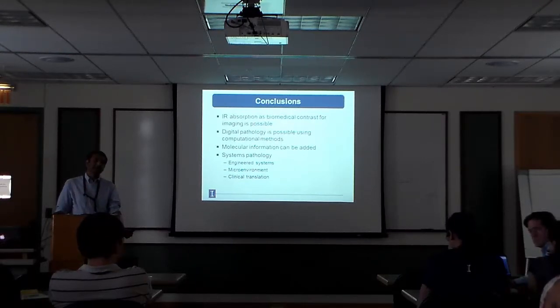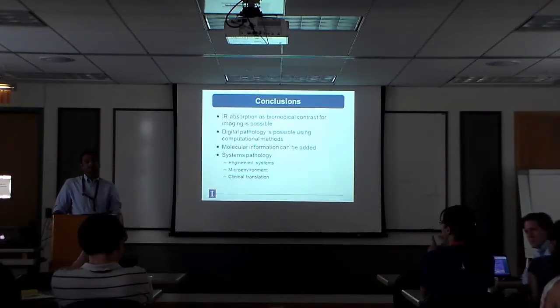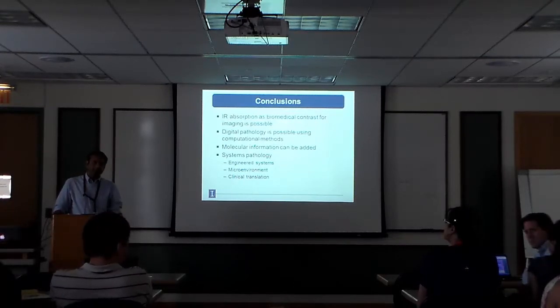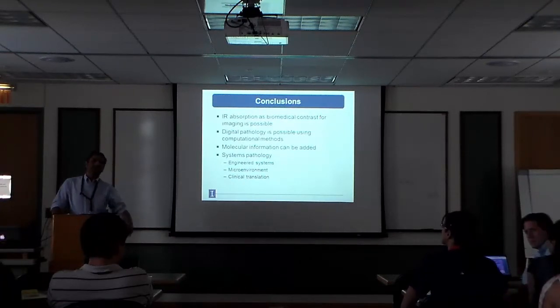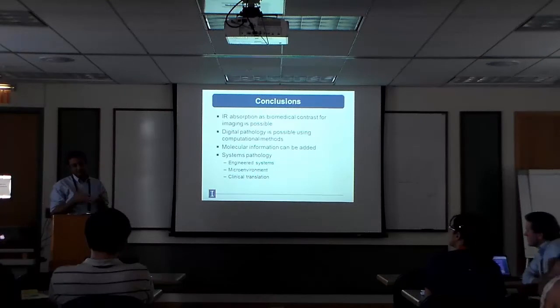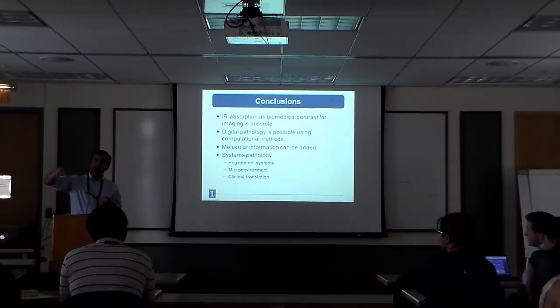The other thing is resolution, because you can go beyond the diffraction limit. Using the spectral features. Yeah. Then won't it give the disparity of resolution across the tissue? That's brilliant. So what she's saying is that there are a few things, right? So one is if you have a domain, the resolution within that domain versus how sharply you can delineate the boundary will be different, right?